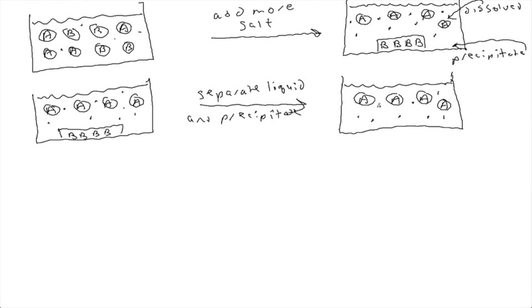What does it mean to denature the protein? Denaturing the protein is unfolding it so it lacks secondary, tertiary, or quaternary structures. But remember, the whole reason we're separating this protein is probably because we want to study it. And if we want to study it, we probably want to study it in its folded condition, because that's its normal condition in the body. So it's not much use to have a protein that's completely unfolded. You want to study the protein so that it can carry out its normal actions. So we have a problem.